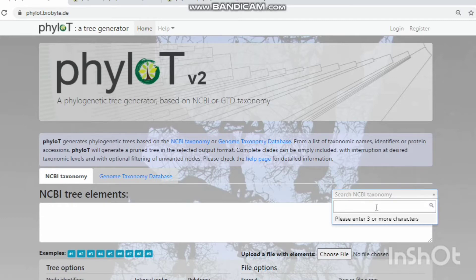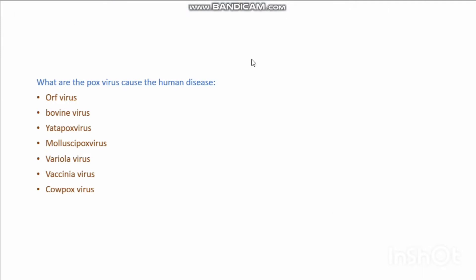This is the input box used to add the tree element. The tree element can be the species name, an NCBI taxonomic ID, a UniProt accession number, or a reference sequence protein accession number. I have collected the poxvirus evolutionary relationships based on an article, and selected eight species whose names will be given as input in PILOT.